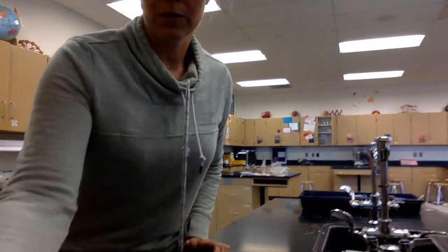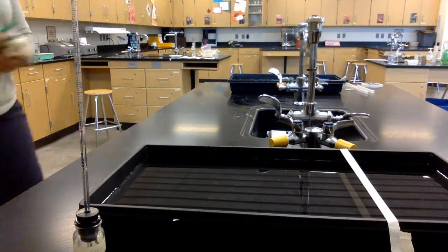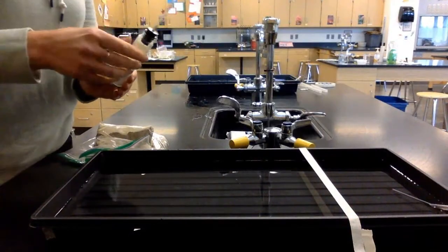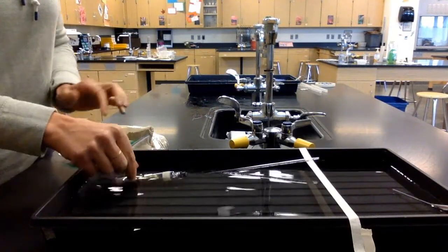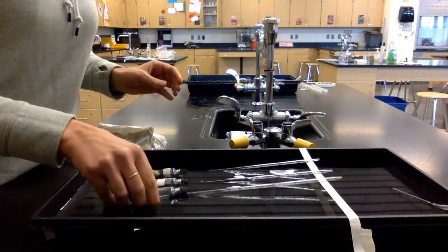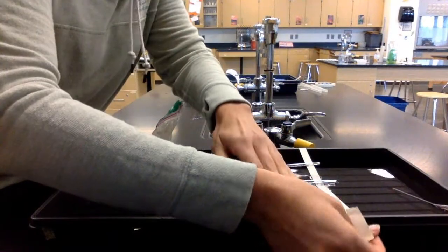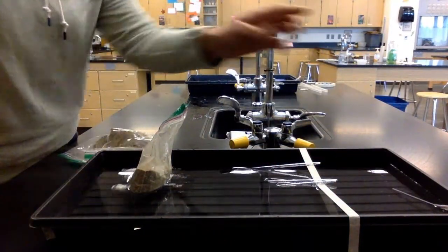I'm going to set these up by the water bath — I need to grab some sandbags. I have tape marking the 25-degree bath, which is my room temperature bath. I want these to be submerged, so I'll put respirometers one, two, and three in there and place a bag of sand on them so they don't move and stay submerged. Make sure the tips of the pipettes don't go into the water.